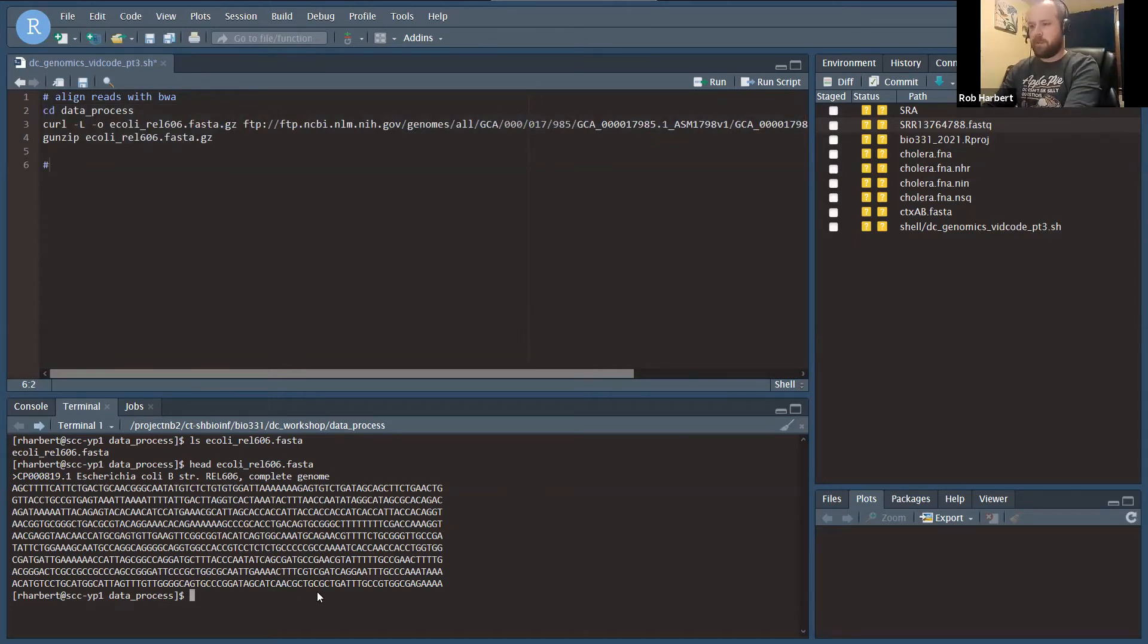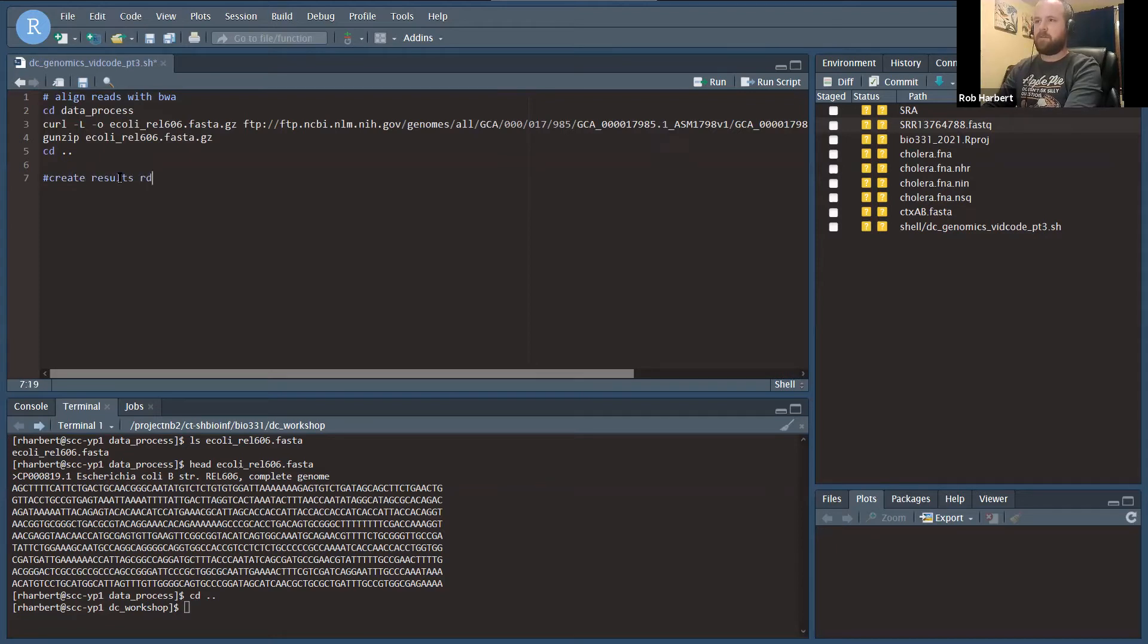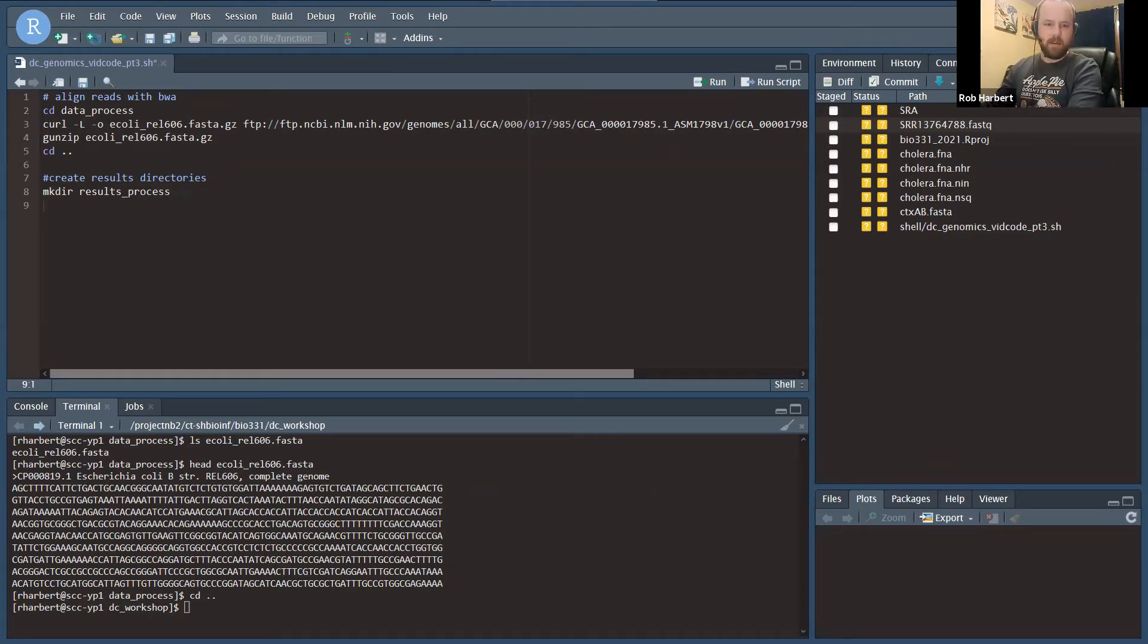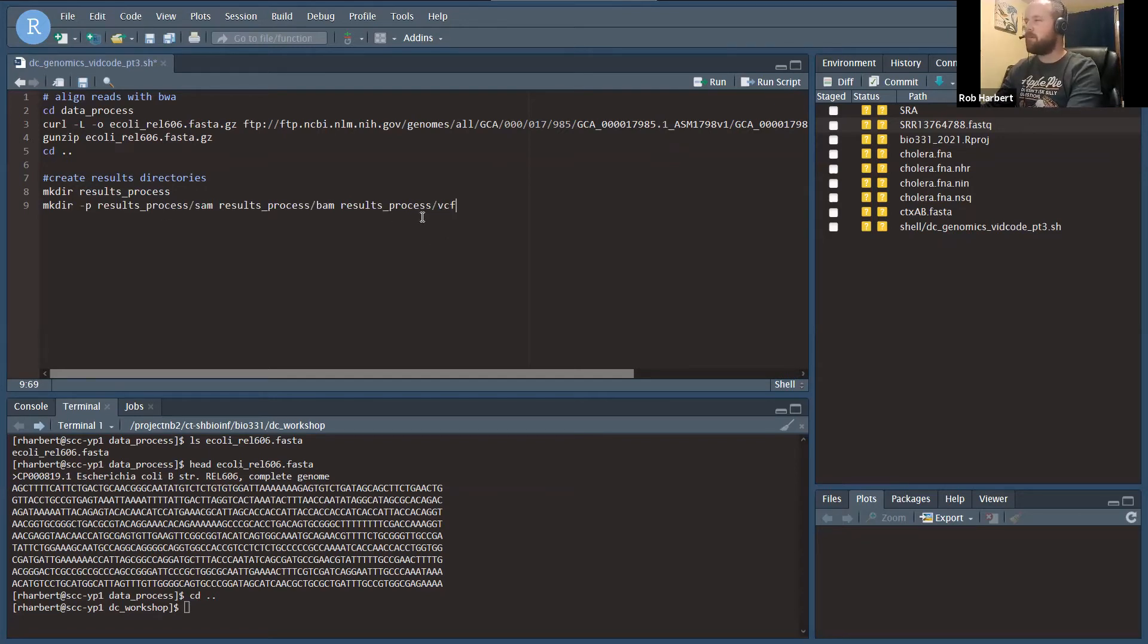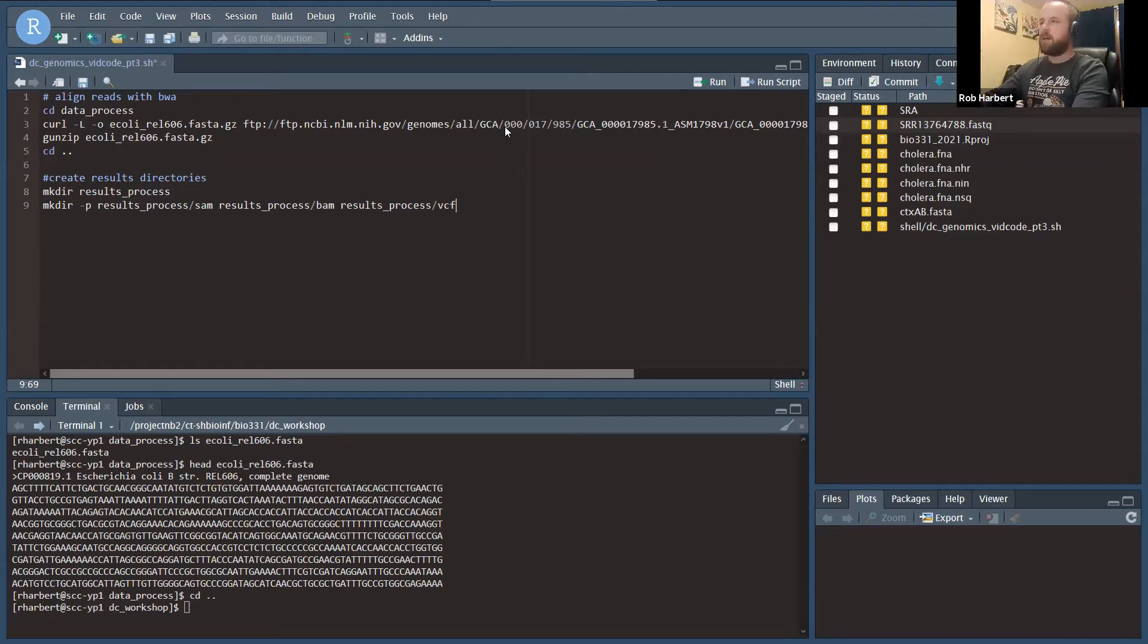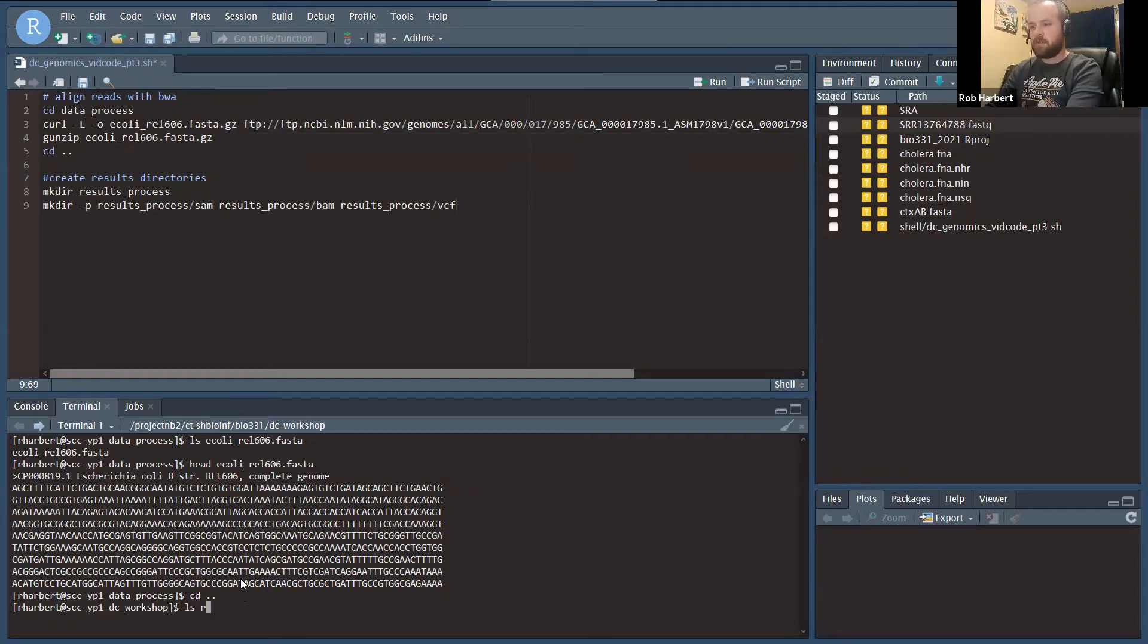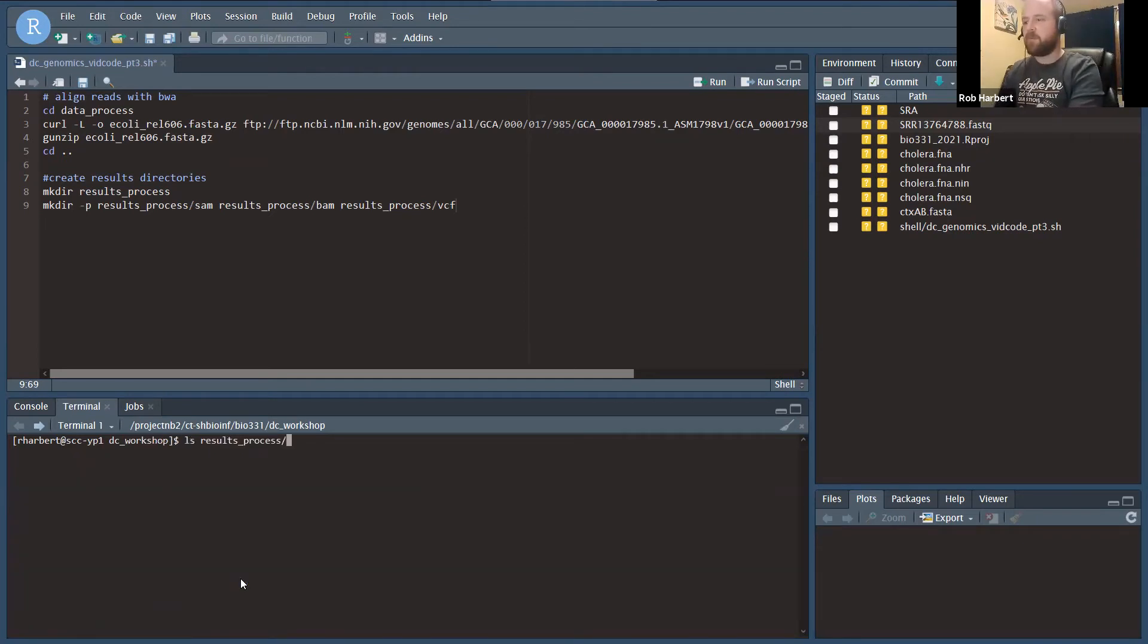We're going to cd back to data process, and then we need to do a couple things. We're going to make a directory called results process, and then make three folders inside that results process folder: one for SAM files, one for BAM files, and one for VCF files. Today we're only working with SAM files, but next time we'll convert SAM to BAM and hopefully get to our final product, the VCF files, the variant calling files. I've already run that and you can see there's three folders in there: BAM, SAM, and VCF.